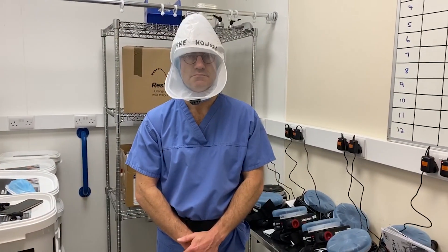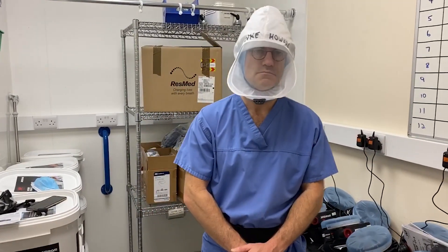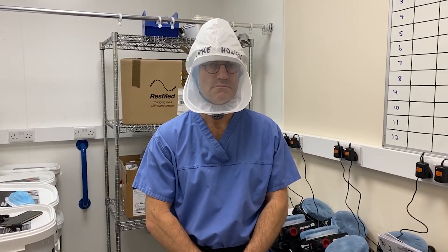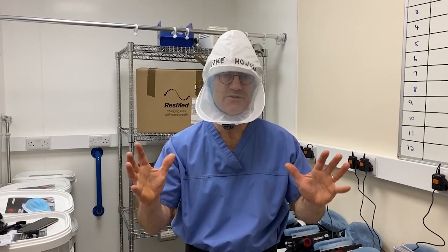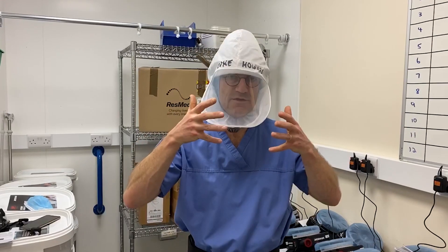On top of this, you then put your full PPE on. In the negative pressure ward, are you going to be doing double gowning and double gloving? Yes, it would be exactly the same as if you were using the FFP3 mask and the visor. Everything else is done exactly the same.